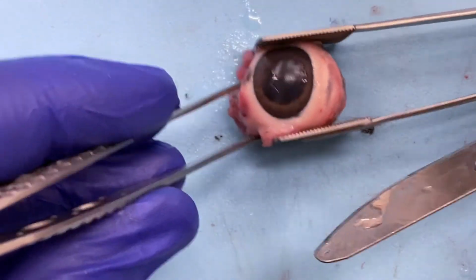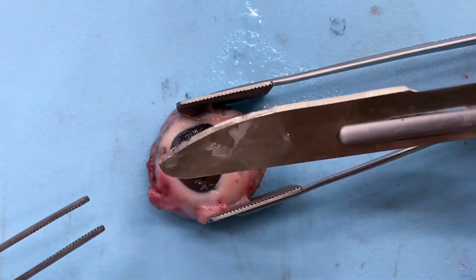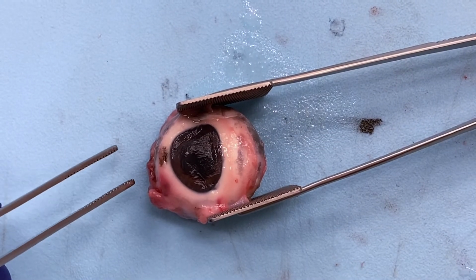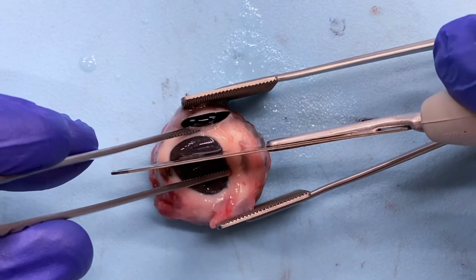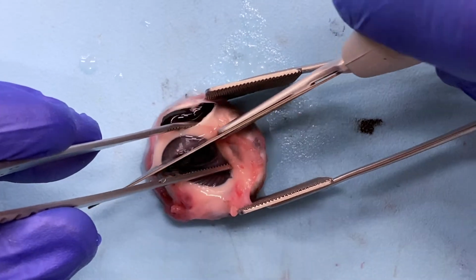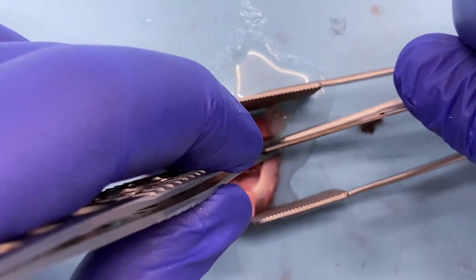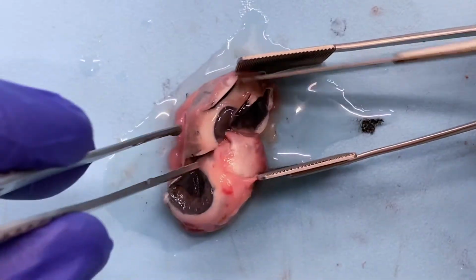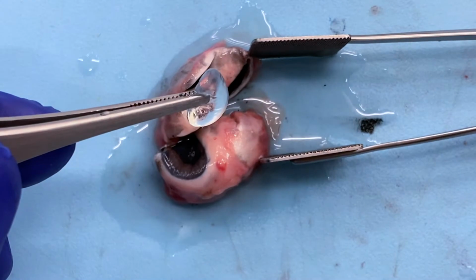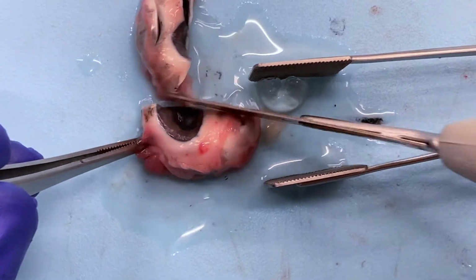So now I'm going to go ahead and use my paddle forceps, and again, keeping our little tumor location in line. You can see that there. I want to make sure I get that section with my optic nerve posteriorly. So let's go cut one side. Honestly, this cut, the first cut that you get, oops, just got splashed again, is going to be the most difficult. And once you kind of make it in there, just try to do a nice forced slice through, okay? So what popped out here is my lens, which is kind of cool. We're going to try to keep that in our section, but for the time being, it's loose.